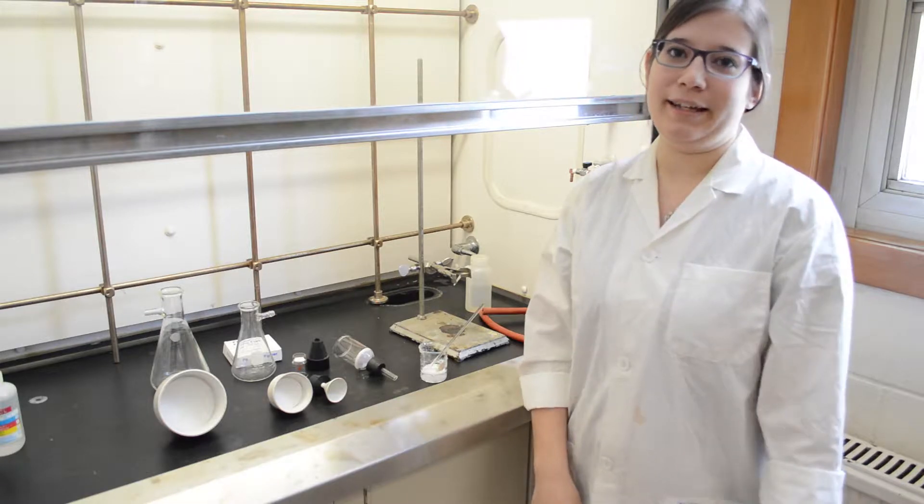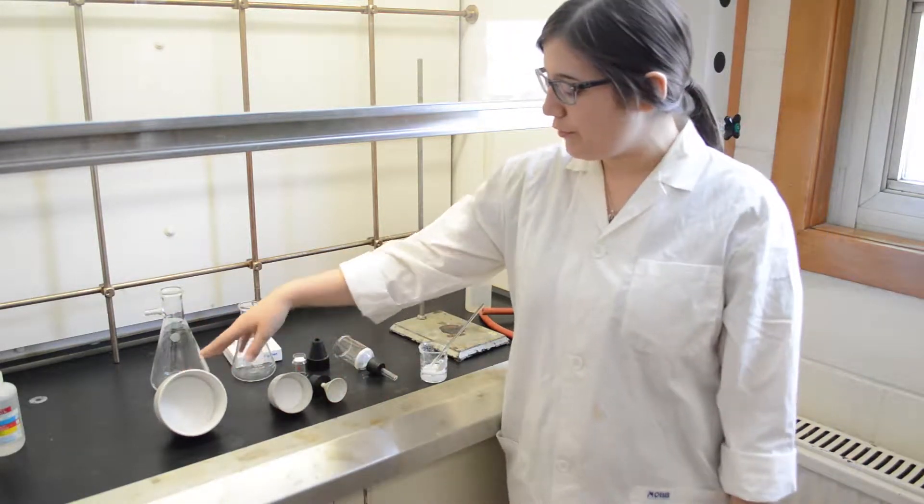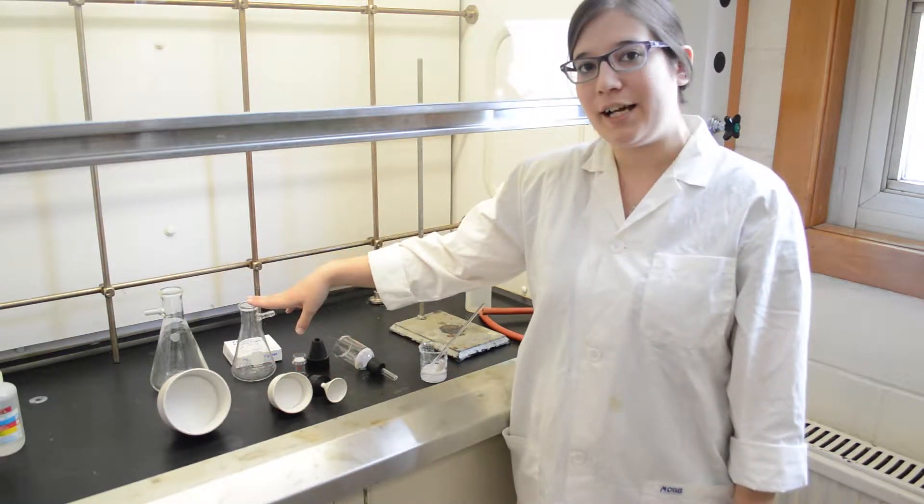Suction filtration in the organic labs can be done with many different types of equipment. We have large Buschner funnels and small Buschner funnels which must be used with 500 and 250 milliliter filter flasks respectively.